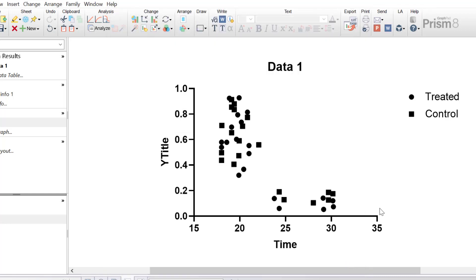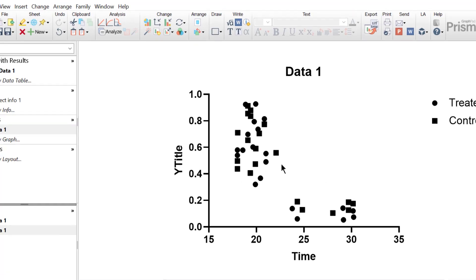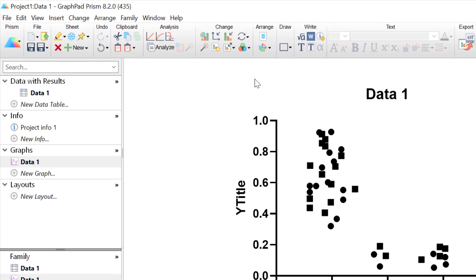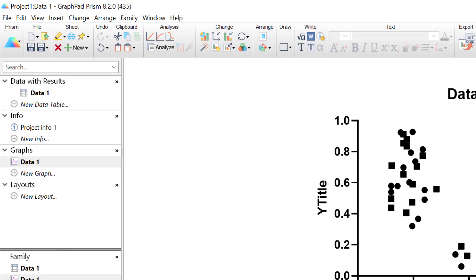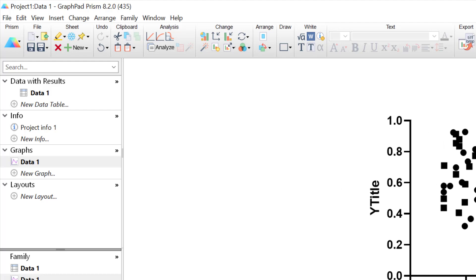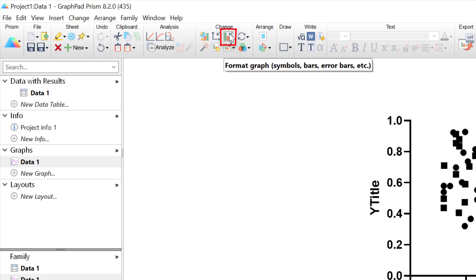As with any graph when you first start you may wish to change the colours. The easiest way is by using the change colours button at the top, which is explored in more detail in a separate quick tip video tutorial. Instead I'm going to fine-tune the appearance by going to the format graph button at the top to open up the format graph window.